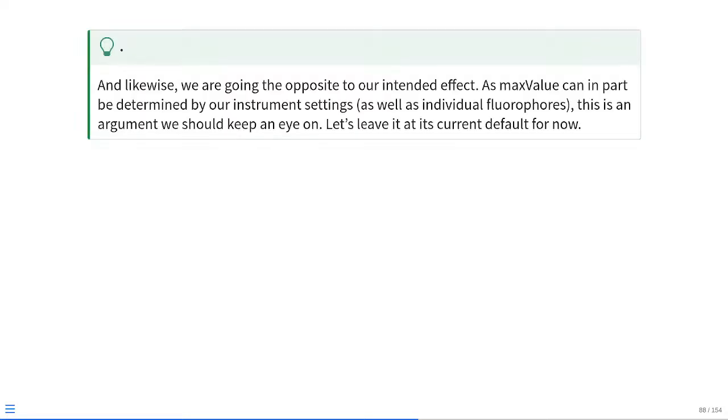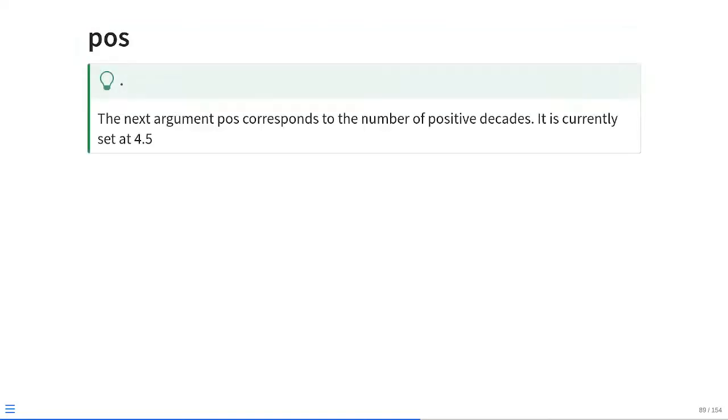So seeing as we could make changes to it and it was going to be jumping back and forth, let's just go ahead and leave it where we had it so that width is doing the main change to our plot, not so much the max value itself.